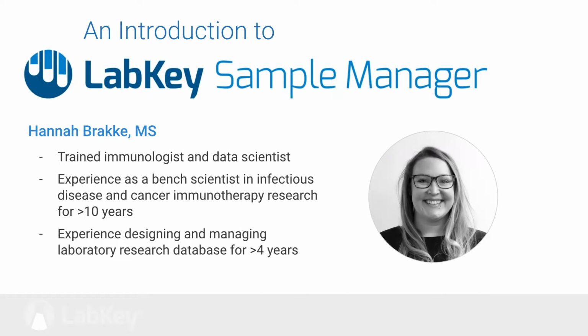When I joined LabKey, I was asked to share my experience with our team to help LabKey create and launch a new product, Sample Manager. For me, getting to be a vital part in designing a software solution that will actually help scientists perform work rather than hinder it has been a really exciting journey.